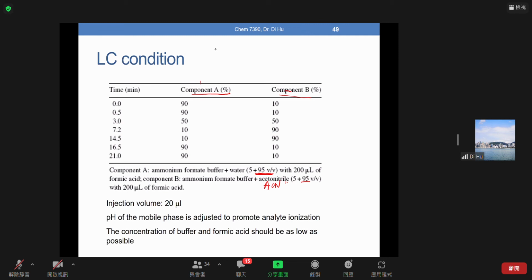And acetone, which is inexpensive, also has a pretty okay elution property like acetonitrile. However, its UV absorbance limit makes it limited in some applications. And ACN has so many advantages, so that's why, if you say ACN or acetone, we still prefer ACN. Okay, so that is the thing to think about.